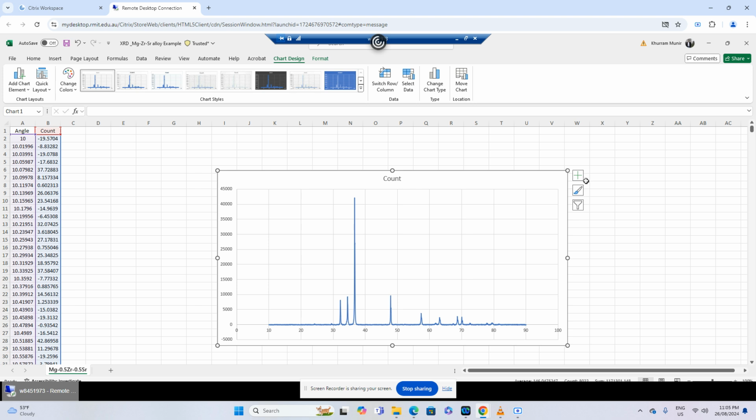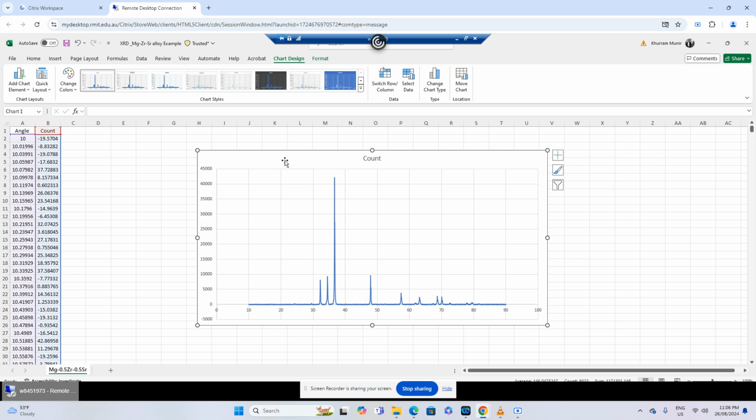So all the analysis is done on an offline software. Normally, EVA software is used to do a data analysis on this spectrum, which is obtained from the XRD machine. Now, when we use that software, EVA software, we actually provide this software some information.